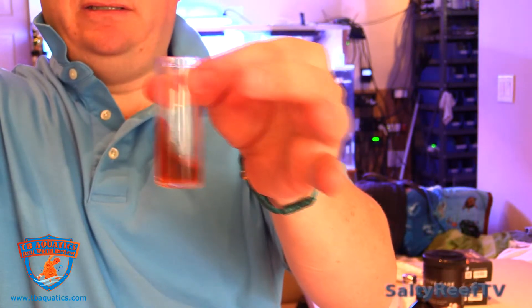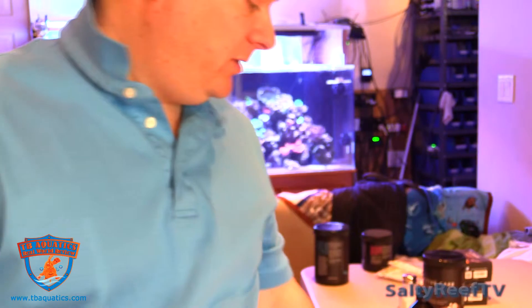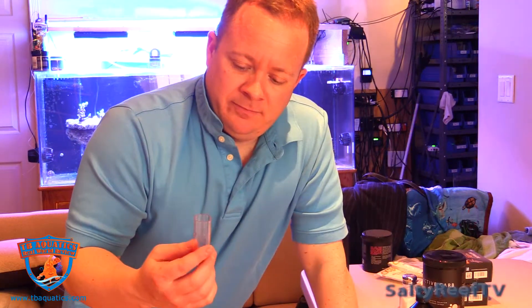It got slightly darker, so I would guess that maybe the final value would be ten and a half. I don't really care about locking in the numbers — I just want to avoid big swings. I'm going to rinse this out and then test with the API to see if we're around ten, ten and a half.